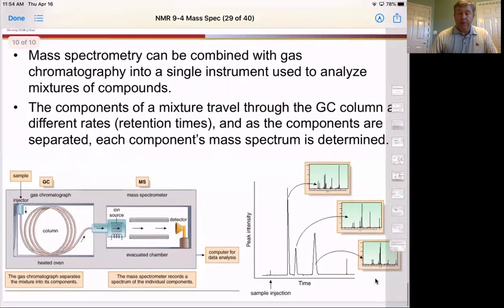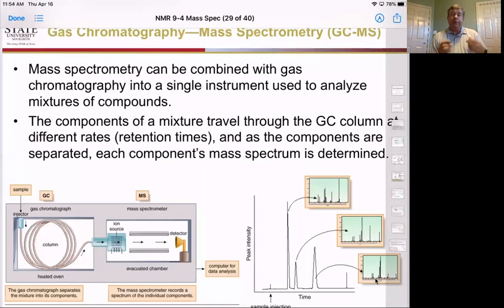All right, so now using mass spectrometry by itself can tell you a lot about the compound, and you can see the fingerprints of using it as a fragmentation pattern to positively identify that particular isomer or that particular compound. But you can also use it on mixtures.